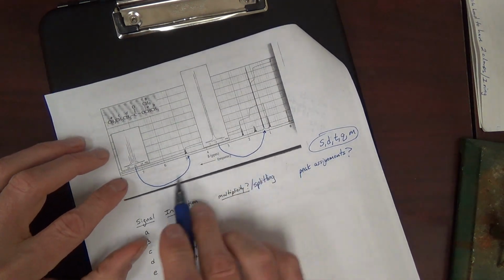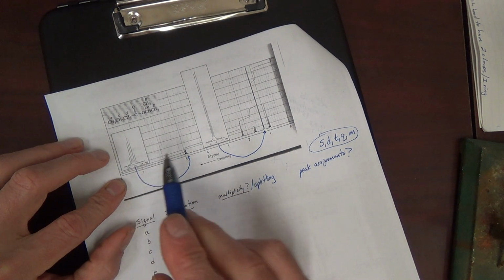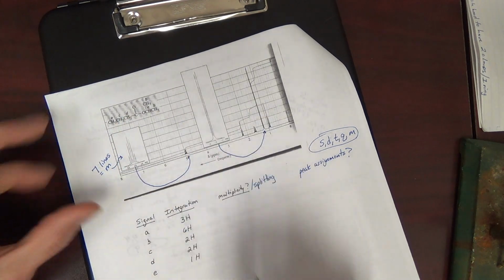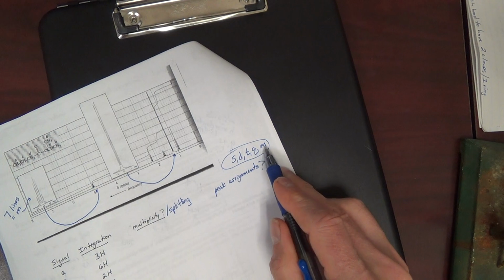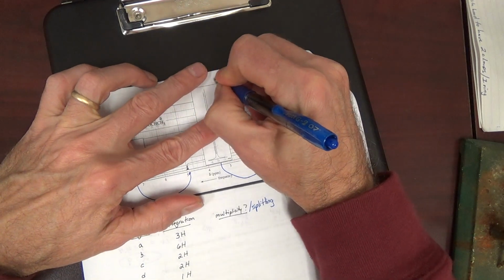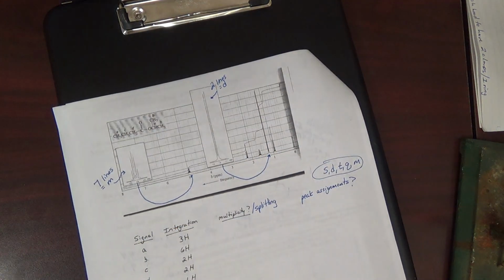They're expanding it so you can tell how many lines are in this signal. And this is 1, 2, 3, 4, 5, 6, 7 lines. And that's going to be a multiplet, because when it's above 4 lines, we start just calling it a multiplet. Where this signal is 2 lines, okay? And that's a doublet.